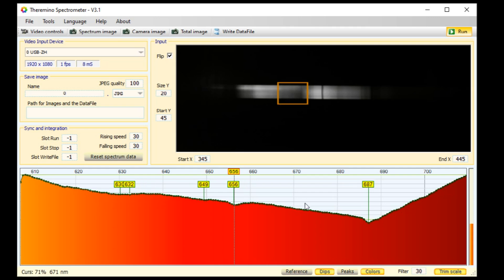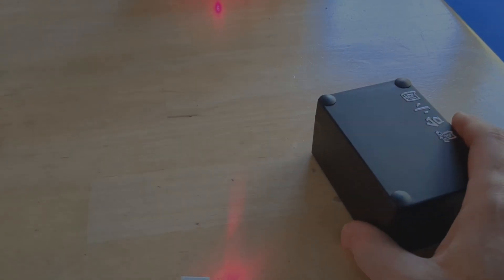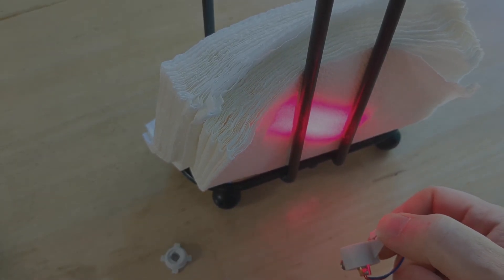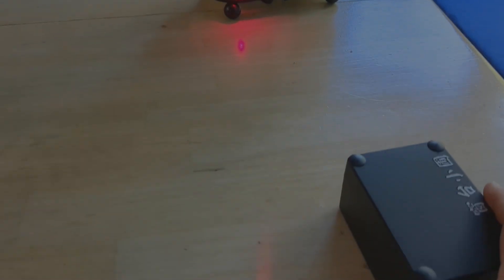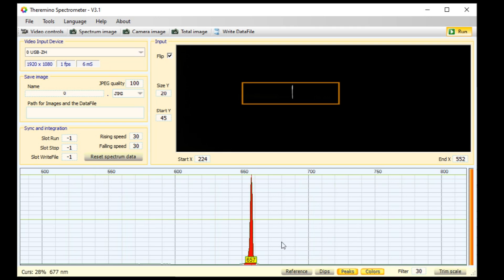Now it's time to test a laser. Shine the laser at something and point the spectrometer at the same thing, then aim around until you get a nice skinny peak. You can optionally defocus the laser or remove the collimating lens, but I just aim the spectrometer roughly in the same direction and it picks up the faint laser light. Enable peaks, disable dips, and trim scale. My laser is at 657 nanometers. When I first turn on the laser, it tends to be about 3 nanometers lower and within a minute or so settles to its final wavelength. My cheap laser pointers are usually between 653 and 660 nanometers — every laser is unique.